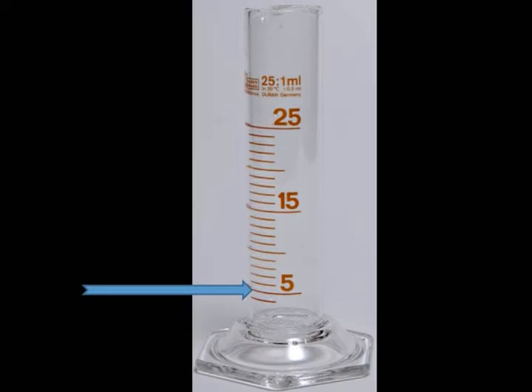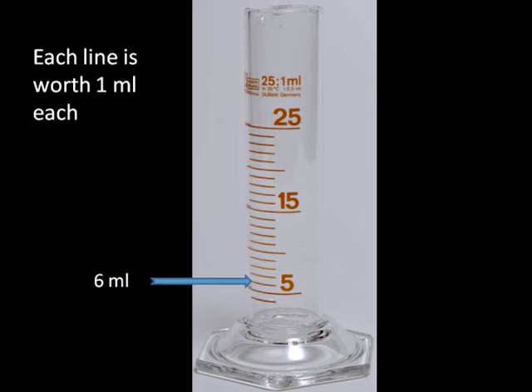Let's look at another example. On this example, the bottom number is 5. The top number is 15. So there are 10 milliliters in between. And they go up 1 milliliter at a time from 5 up to 15.